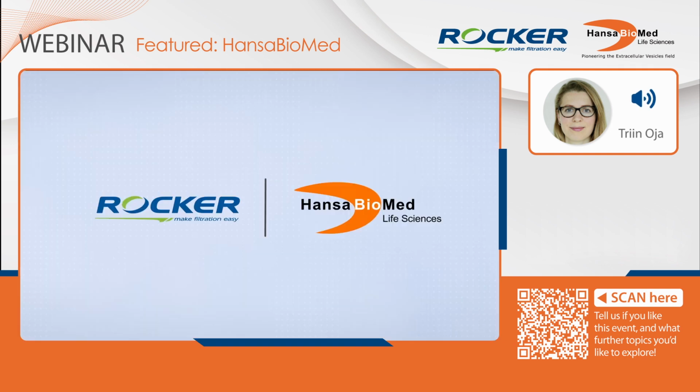And Tina is going to show you a video on how to use the TFF with the filtration system.